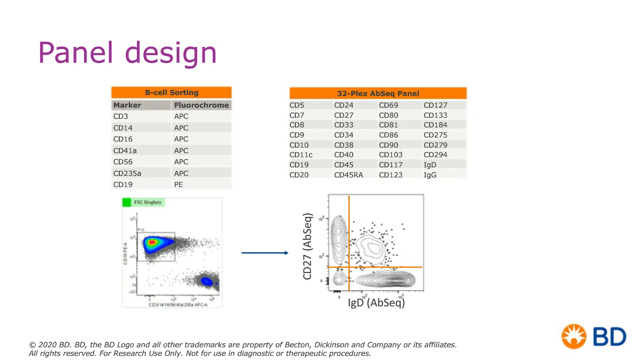But if we were to do that, depending on which populations you want, I mean, probably 3 different populations that we would be sorting times our 7 donors. And then, of course, we are going to be doing downstream analysis on this. And instead of adding those markers at the flow cytometry stage, it's probably much easier just to throw in those 2 markers on the AB-seq side.